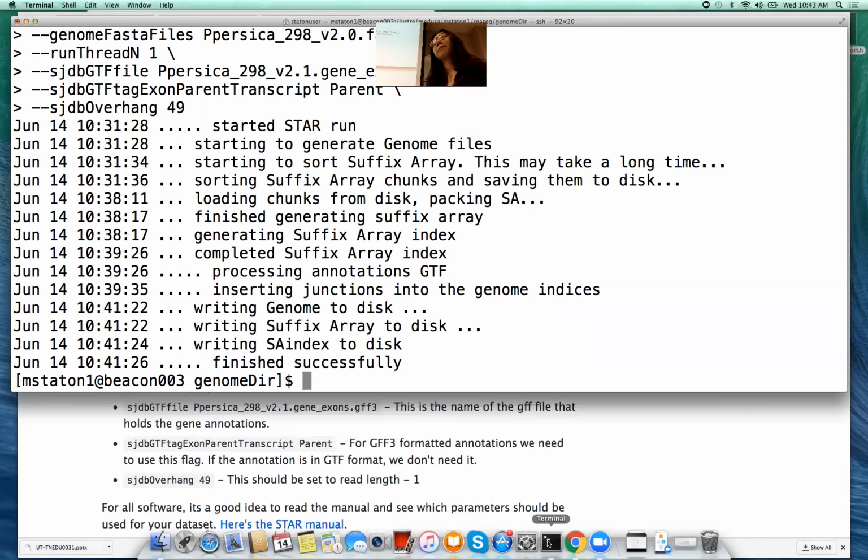I'm sure there is, but off the top of my head, I don't know. For BLAST, the word size is 11 for nucleotides, 5 or 6 for protein. But I think it's much, much bigger when you're doing short read mapping. You're starting with billions of reads, and you can efficiently map them to sometimes billions of reference bases. You need a pretty big word size to make the whole process efficient.